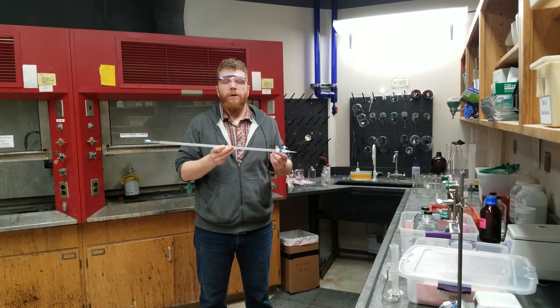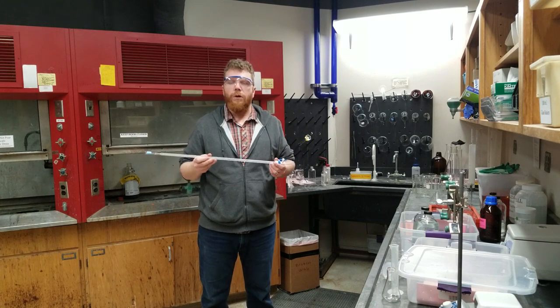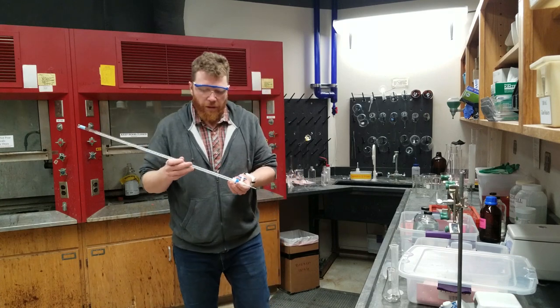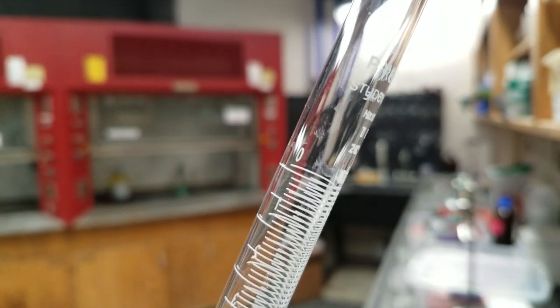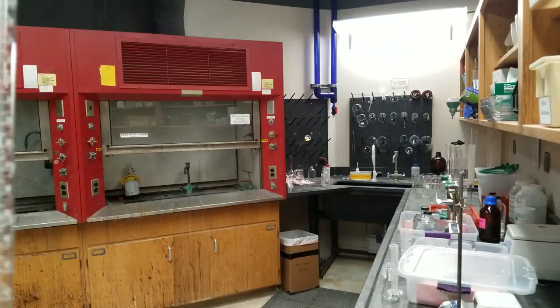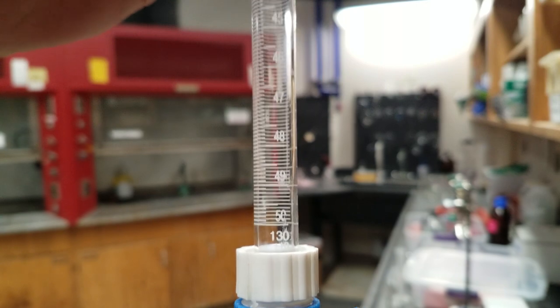The piece of glassware you collect at the stockroom is this right here — it is known as a burette. We are going to be putting a base solution, sodium hydroxide, into this burette. At the top of this burette it reads 0 milliliters, and at the bottom it reads 50 milliliters.